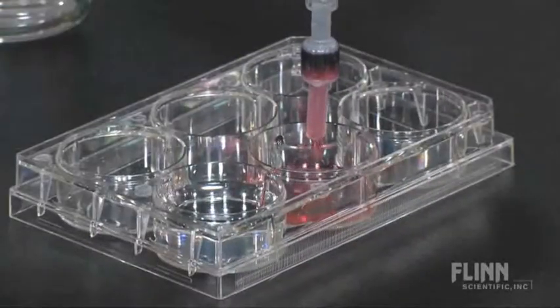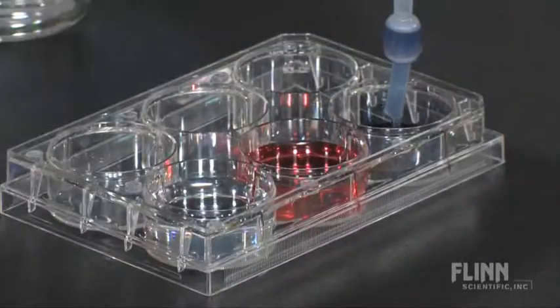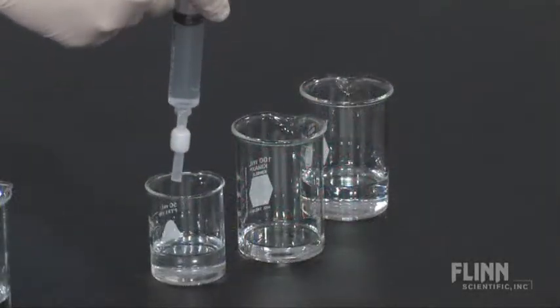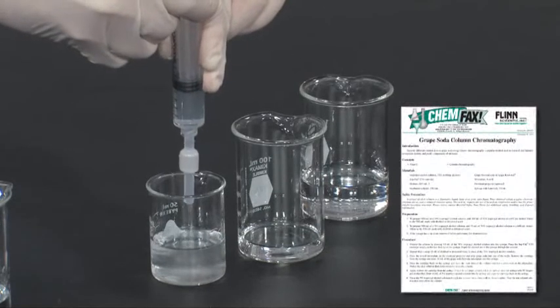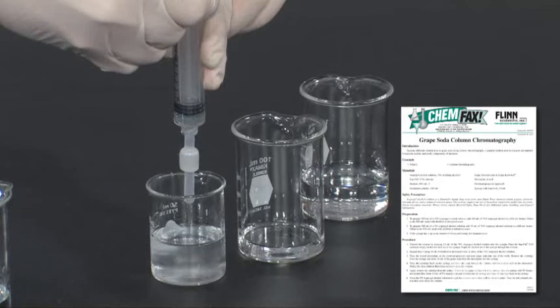The red dye comes off first, followed by the blue dye. The demonstration can be repeated many times — just rinse the cartridge with rubbing alcohol and water following the instructions provided, and store the product for next time.